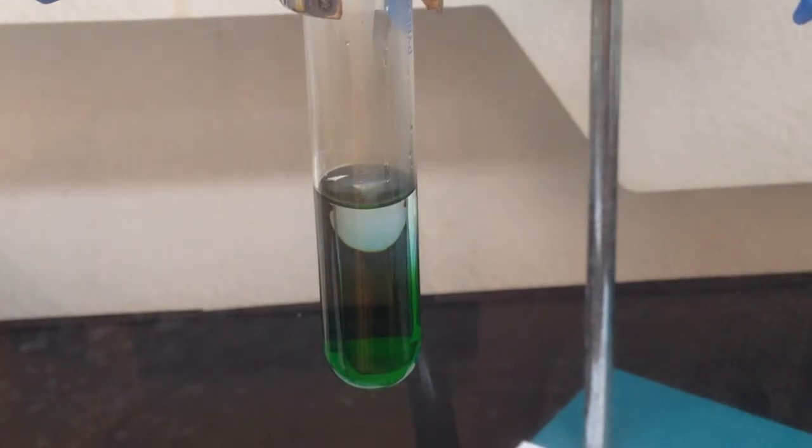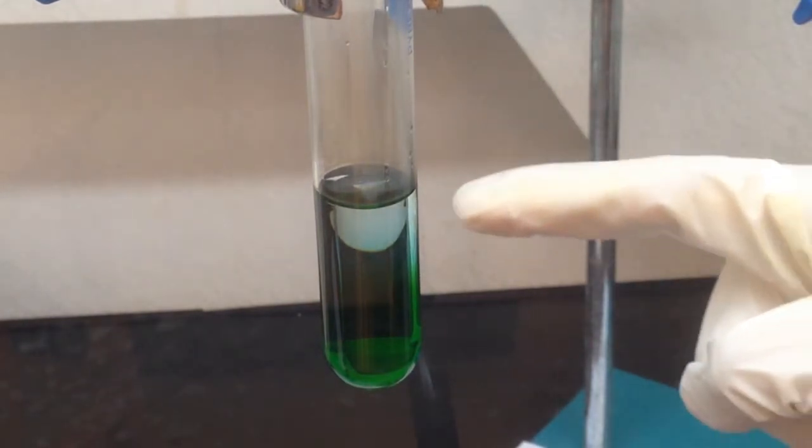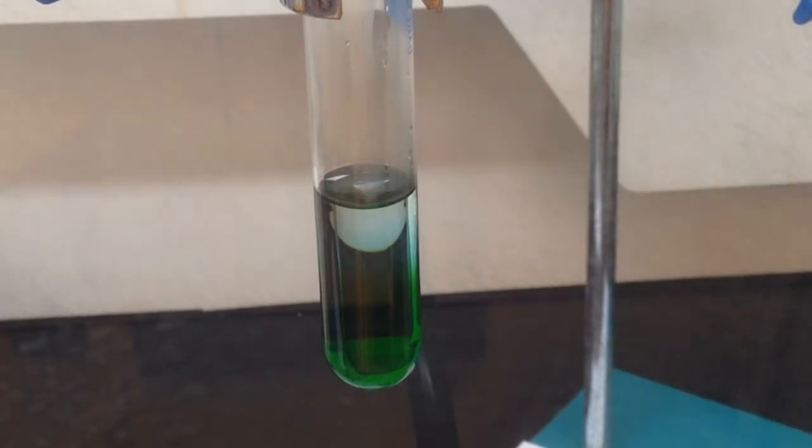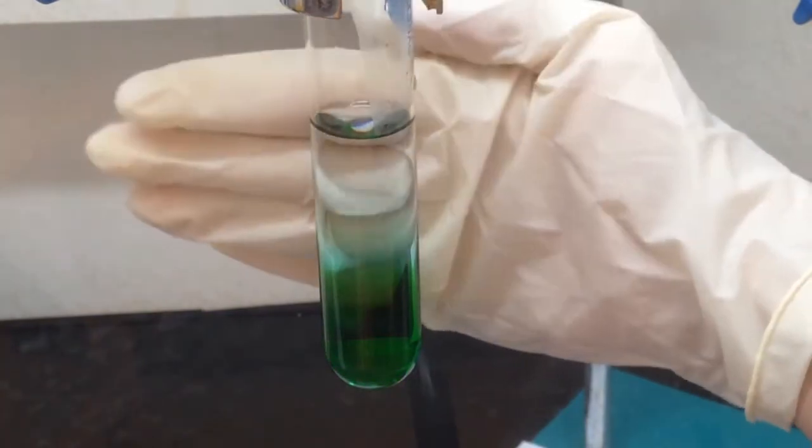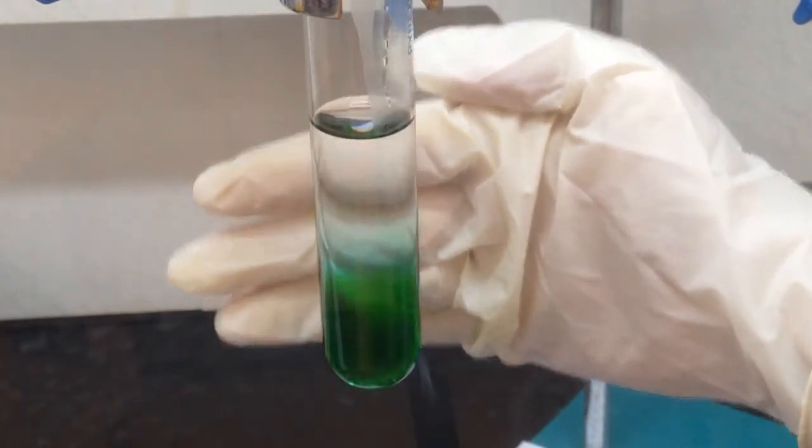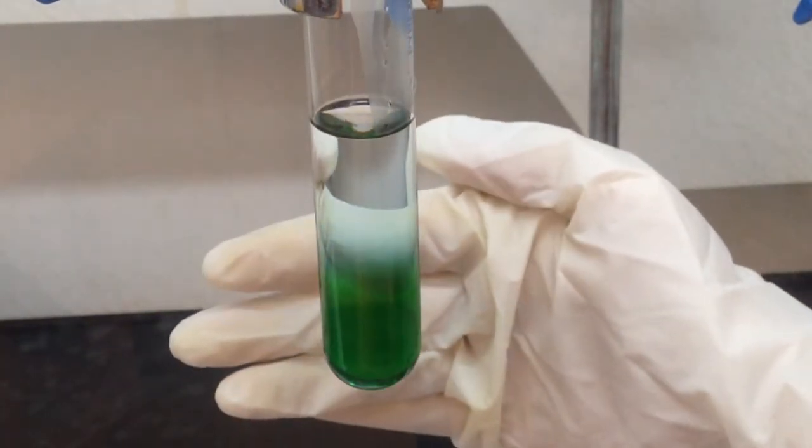Once we add some water, the upper part becomes a little bit blue, and the lower part is still green because most of the water is staying at the upper part. Once we add more water, the blue color becomes more visible.